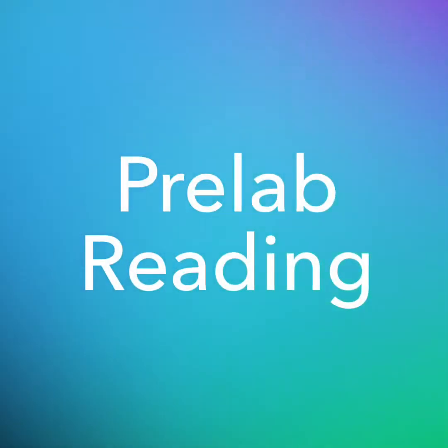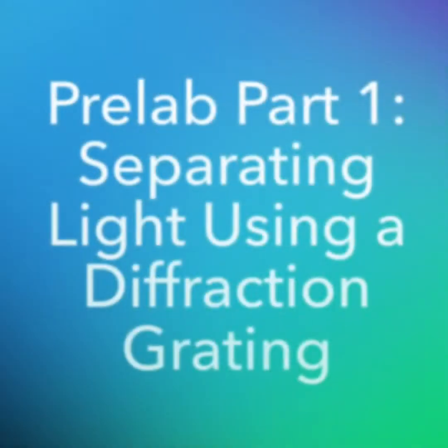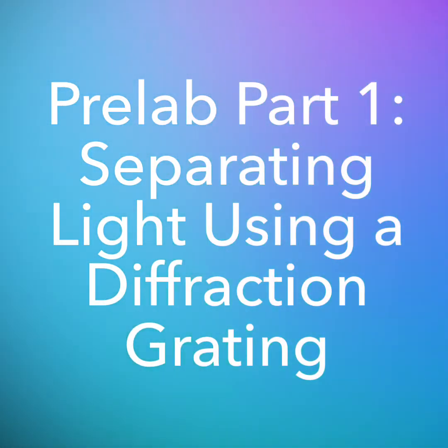Before you continue with this lab, make sure you've already read pages 1 through 5 of your lab handout. Pre-Lab Part 1. Separating light using a diffraction grating.